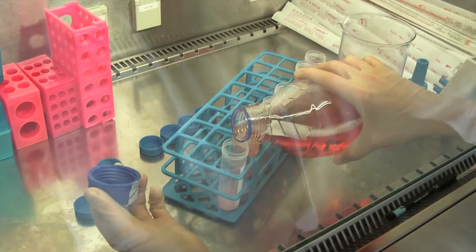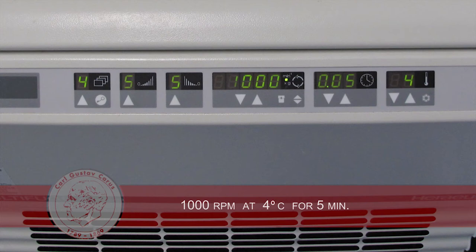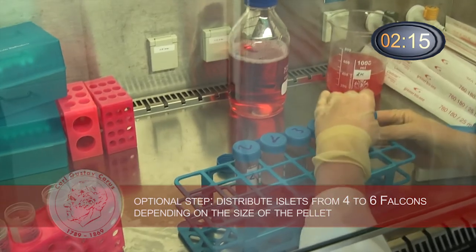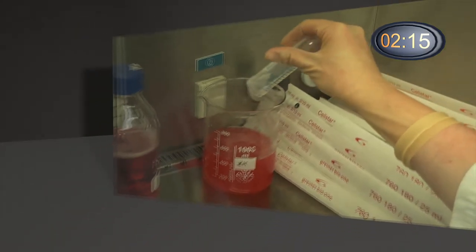The washing proceeds with another centrifugation step of 1000 rpm at 4 degrees Celsius for 5 minutes. As an optional step, we distribute the pellet into additional falcons beyond the original 4, depending on the size of the pellet, in order to improve the washing. Again, we discard the supernatant and gently loosen the pellet.